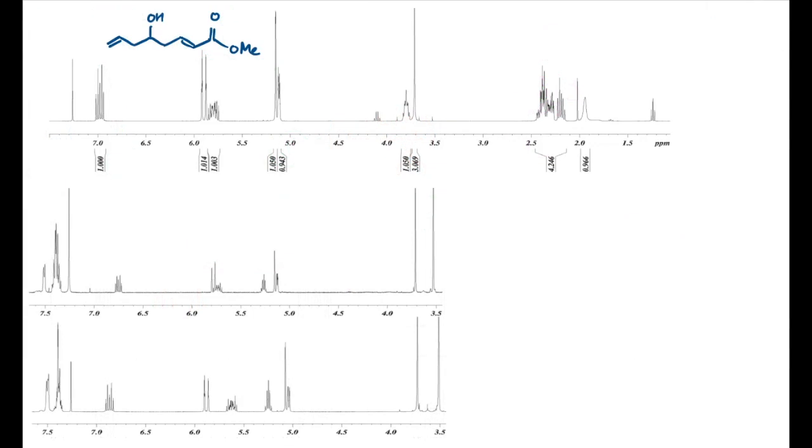Right then, so what I put on the screen now is a duplicate of the original alcohol that we don't know the configuration of, and that's at the top here. And as I said before, we're just going to ignore everything below 3.5 ppm for the purposes of this video, because my computer animation skills are not up to dealing with the messy peaks there. I'll just put the assignments back on.